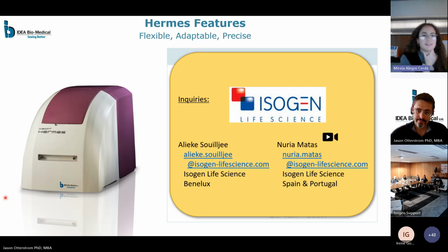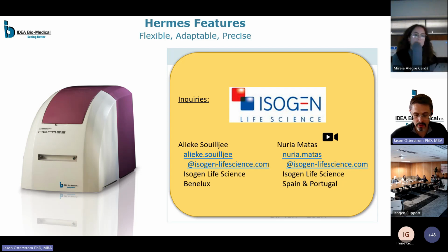Okay, and there's a last one. Can the autofocus work with round bottom and U-shaped plates? Yes. So we have defined a specific patented method in order to image round bottom plates, because since we use the reflection of a laser beam, we had to devise a special method in order to do that, and they're no problem.